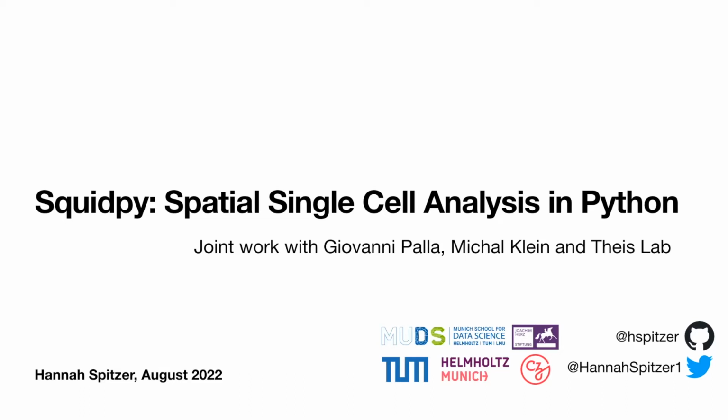And as far as I understand, you've already used Squidpy in some of the previous labs, so you might already be a bit familiar with it, but now this would be the chance to really get into the details of what this package is providing.